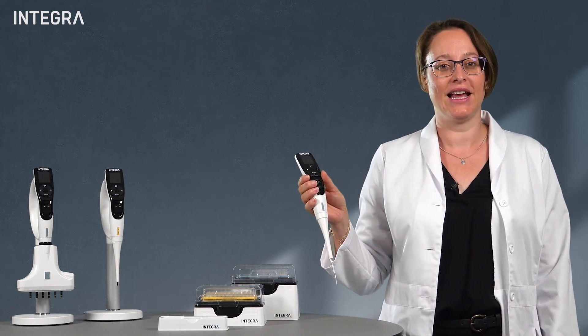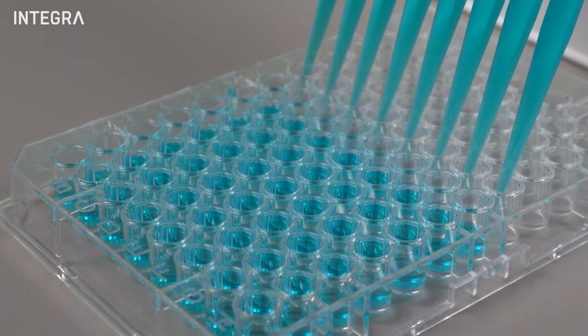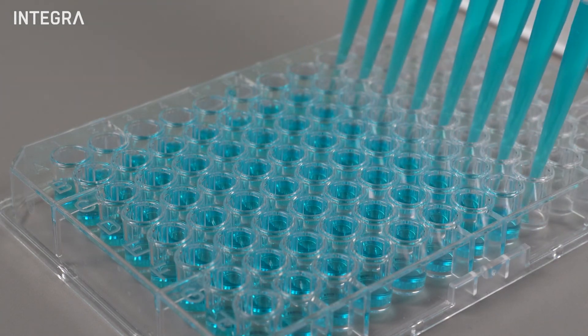In addition, electronic pipets allow for multiple dispenses after one large aspiration, which usually makes you not only faster, but also produces better results.